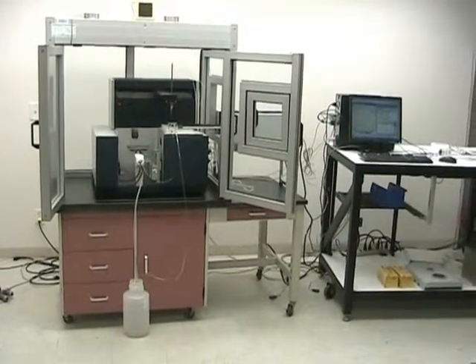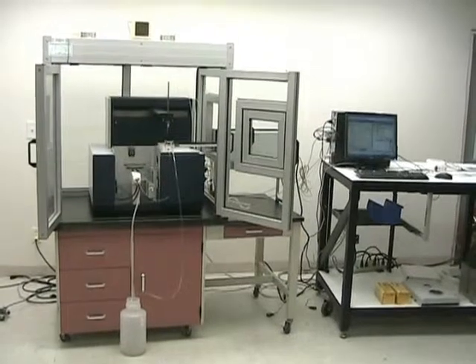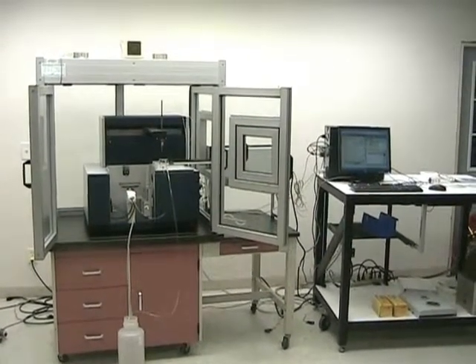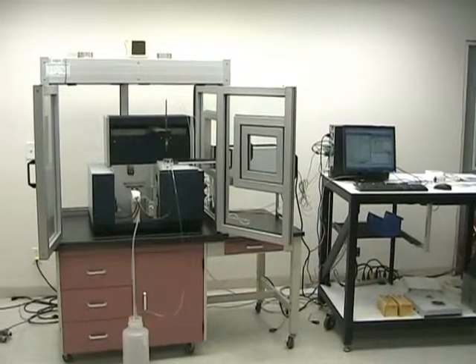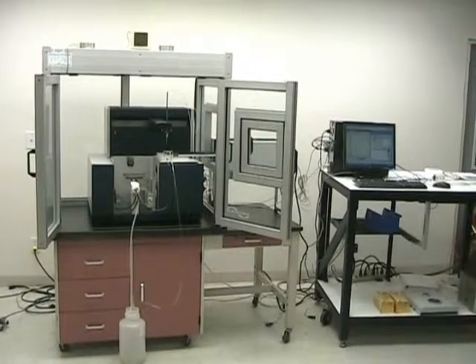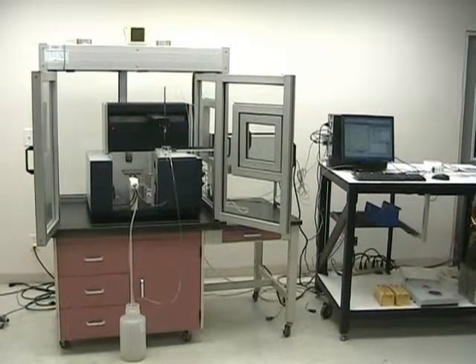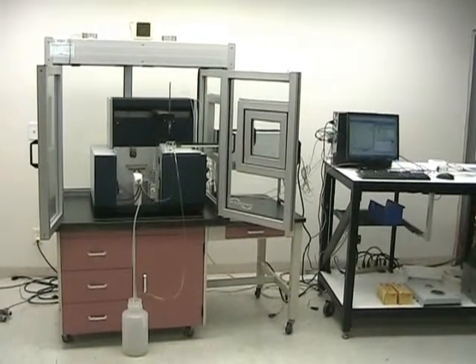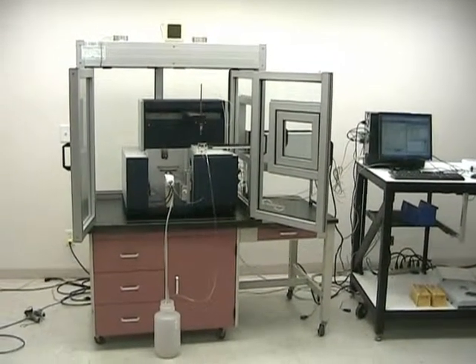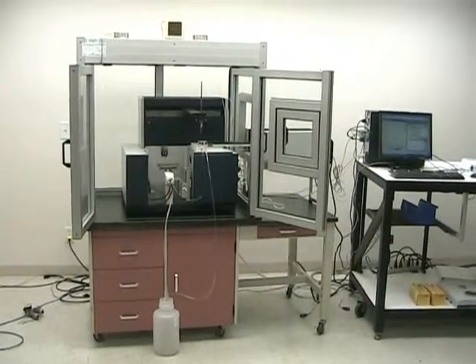We're again here at the New Life Scientific Tech Shop, and today we have a model ICR-8000 made by Aurora. This is an atomic absorption spectrometer, also known as a flame spectrometer, and we've got it all set up. This one does have a few options on it which we're going to cover, and it's also enclosed in a Flow Sciences fume hood so that you can exhaust the fumes from the flames much easier.